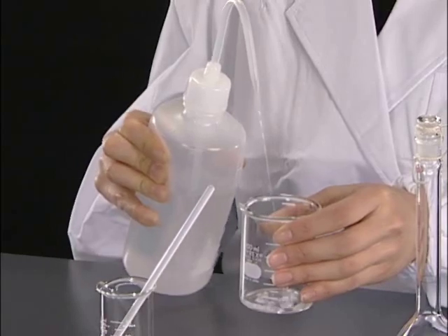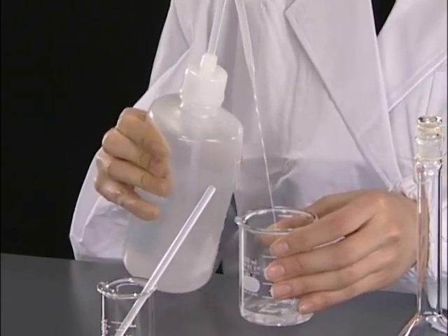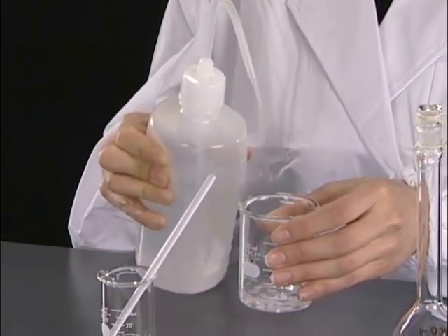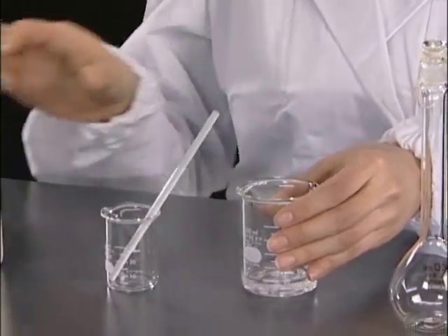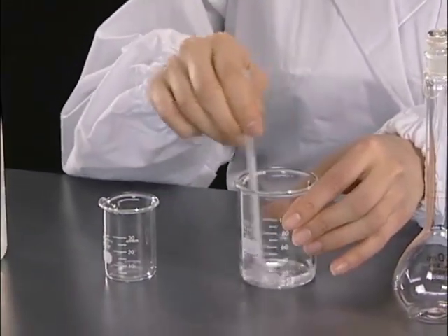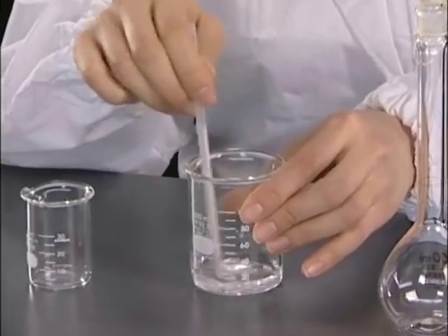First, add an appropriate amount of distilled water to the beaker containing the solid sample precisely weighed. Dissolve the sample completely using a stirring stick.